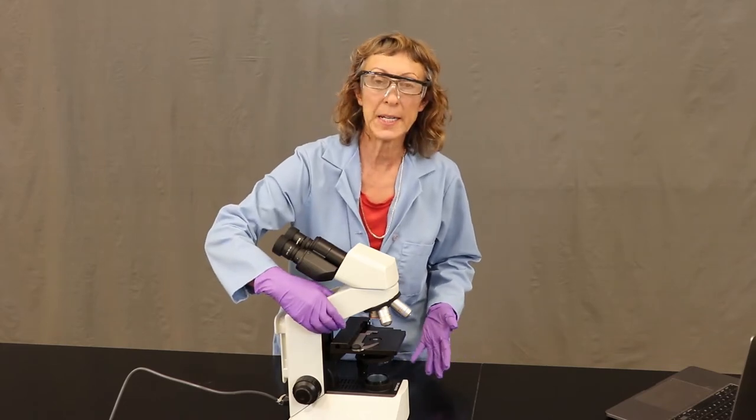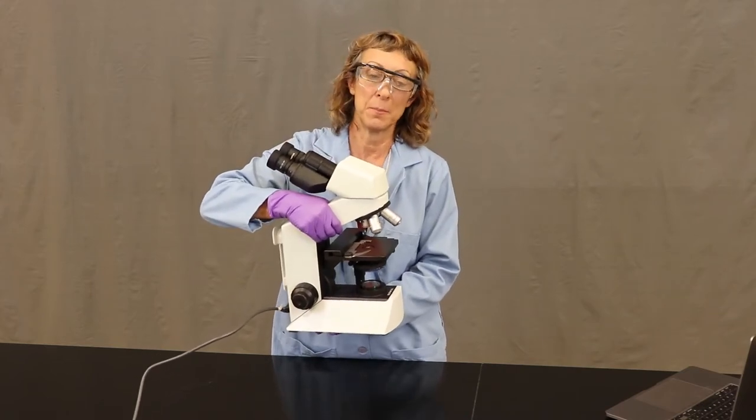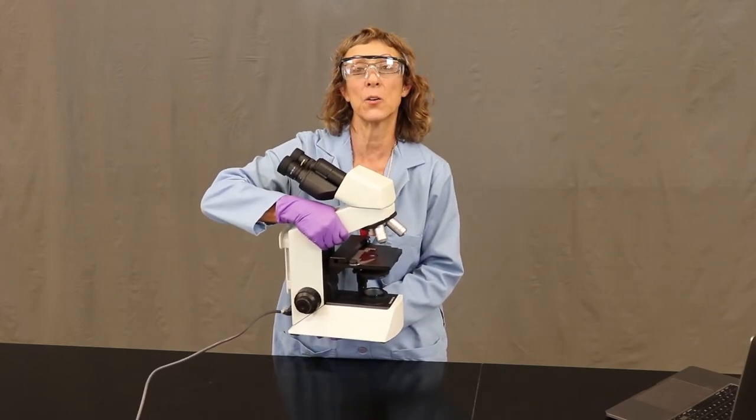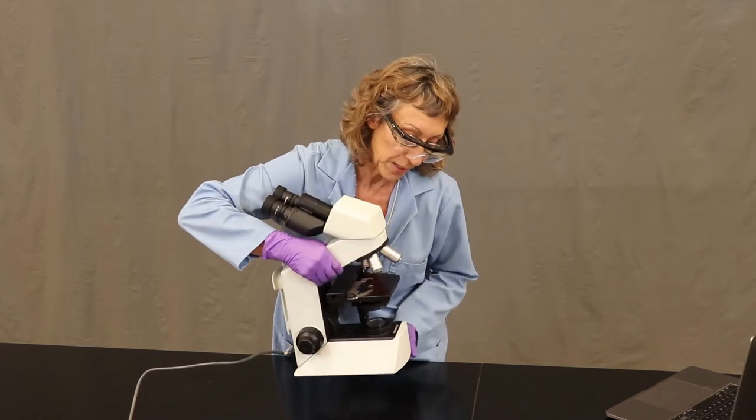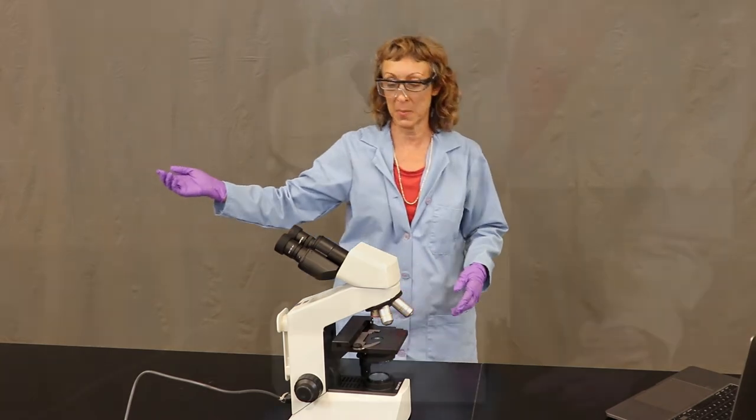And so when we carry a microscope, we always use a two-hand rule. One on the bottom and one in a good place to grab so that it's well supported and you're not likely to swing it around and bang into something.